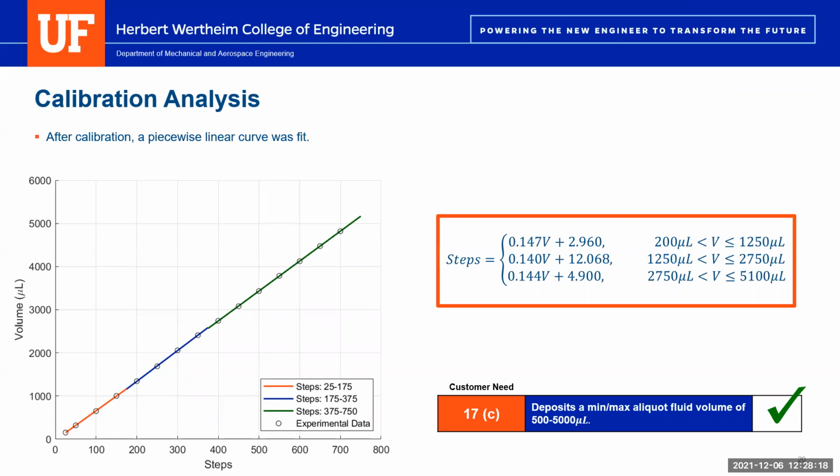Okay, I'm thinking maybe potentially more in the drive components. I would certainly expect that, once you get out to a reasonably large number of steps and a large enough volume, it'll still be fairly linear. But with backlash in the system that grows over time, the intercept may be changing a little bit there. That's a really good point. But if you're talking on the order of 500 microliters, maybe that's not as big a concern as for some of the groups that are focusing on smaller volumes.